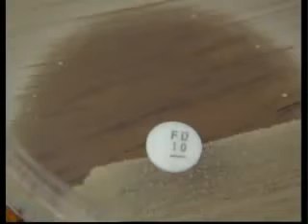With particular antibiotics, careful examination of the zone of inhibition will show a few isolated colonies growing where most of the bacteria have been inhibited. These are spontaneous mutants that have become resistant to the antibiotic being tested.